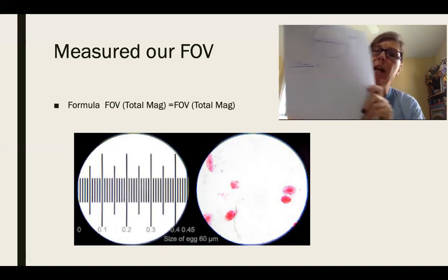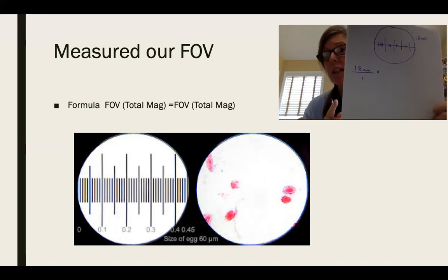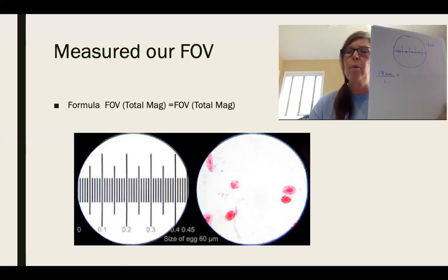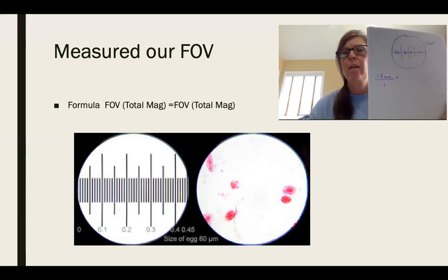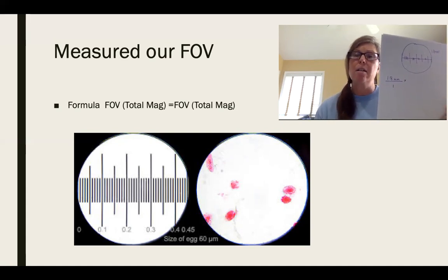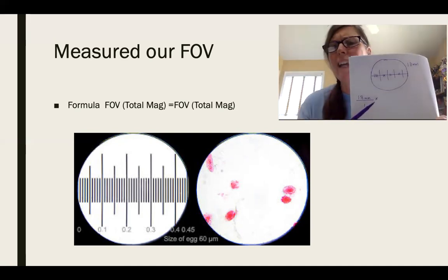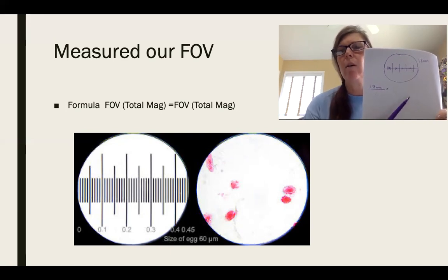And so if you take your number 1.8 millimeters, and make sure you put your units in there, and you're going to put it over 1, because we know if we put any number over 1, it's still that number. 20 over 1 is still 20. 4 over 1 is still 4. Now I'm going to multiply this also by a factor of 1, and everything we multiply by 1 is also that number. So the first thing I want to know is, I want my answer in micrometers, however you want to pronounce it, or microns.